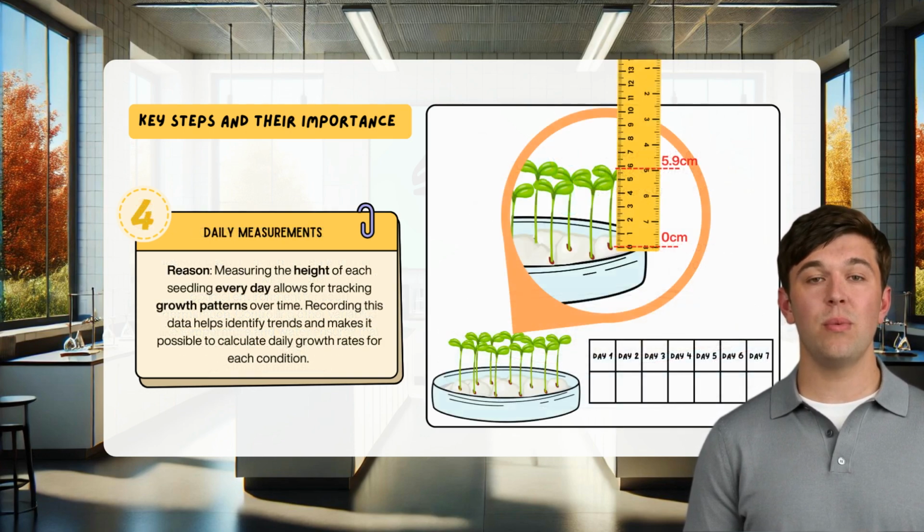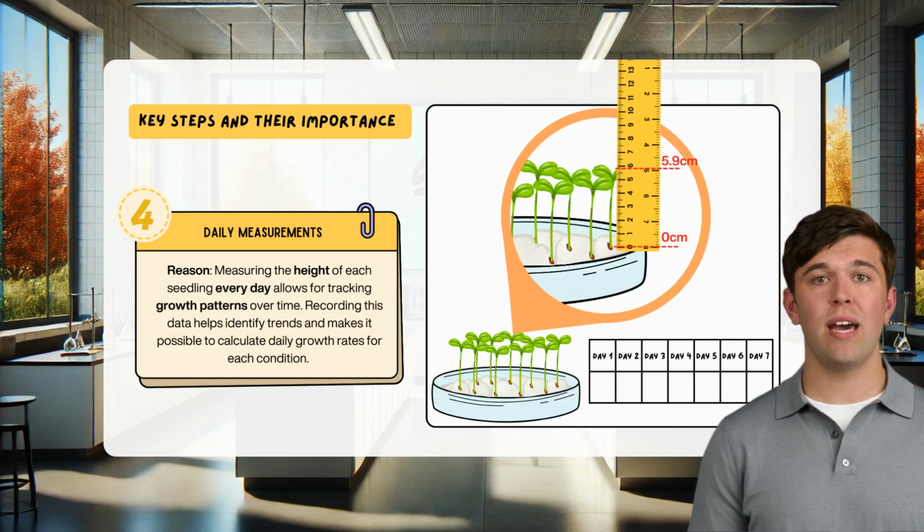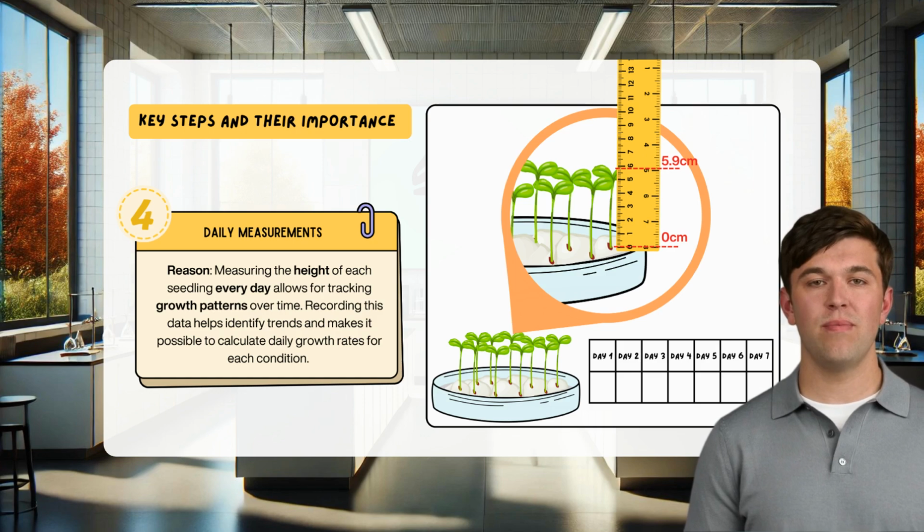Fourth, why did we take daily measurements? Well, measuring the height of each seedling every day allows for tracking growth patterns over time. Recording this data helps identify trends and makes it possible to calculate daily growth rates for each condition.